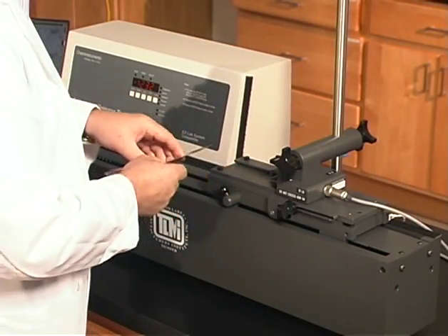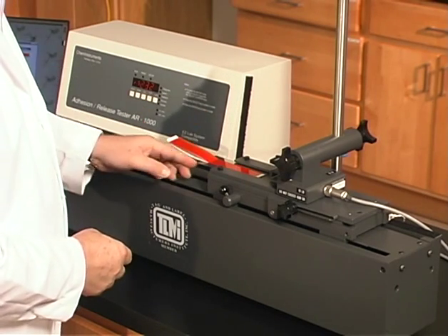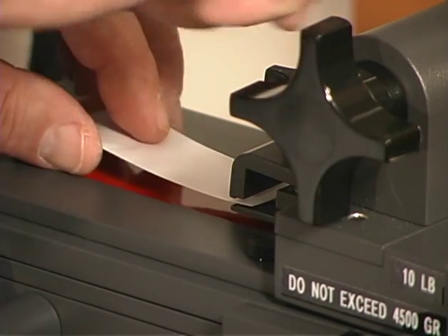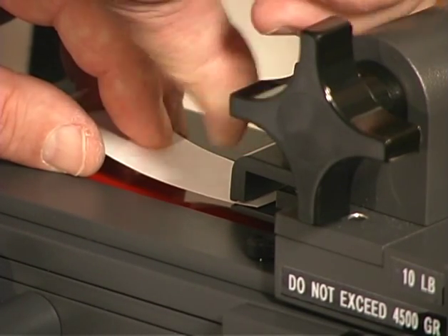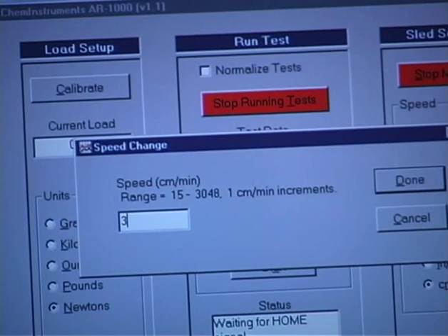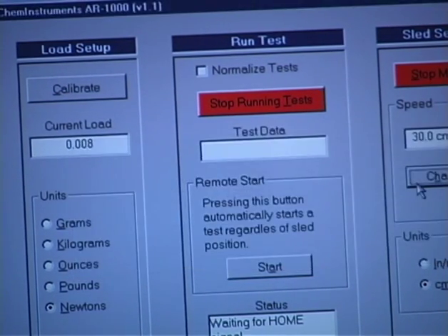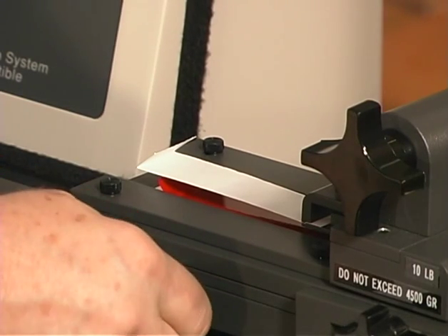Insert the panel into the adhesion release tester set for a 180 degree peel. Fold over the free end of the specimen and clamp it into the load cell of the adhesion tester. Set the adhesion release tester for a 300 mm per minute peel rate and engage the drive.